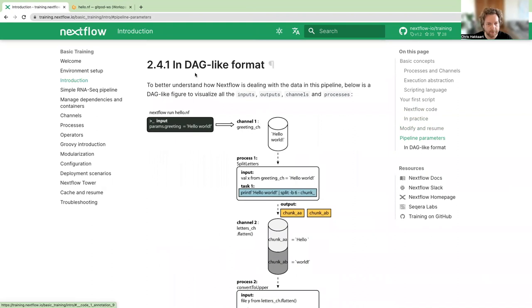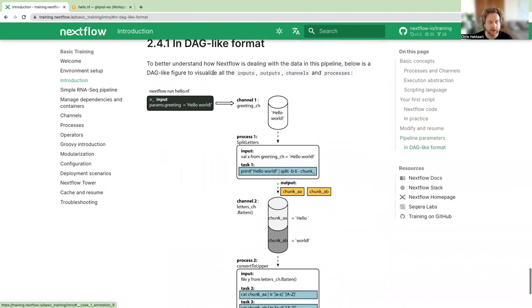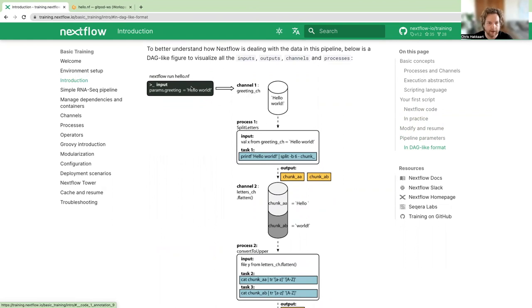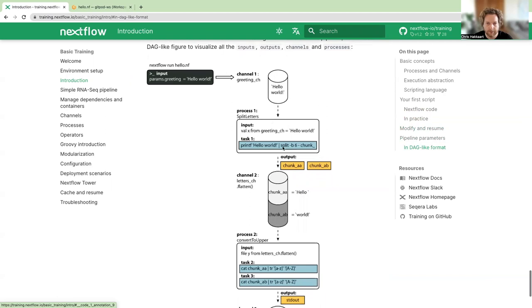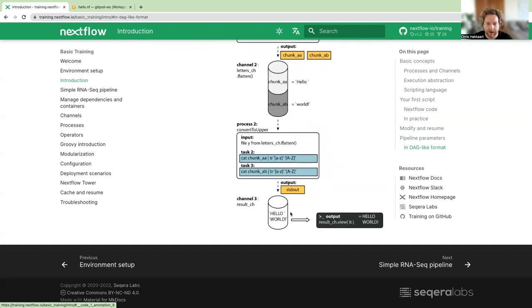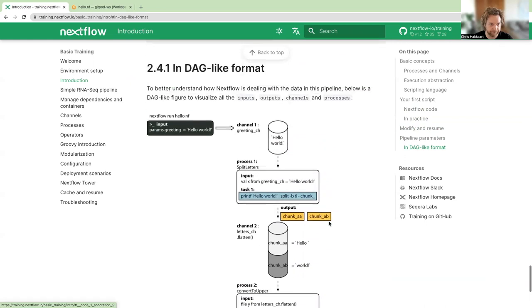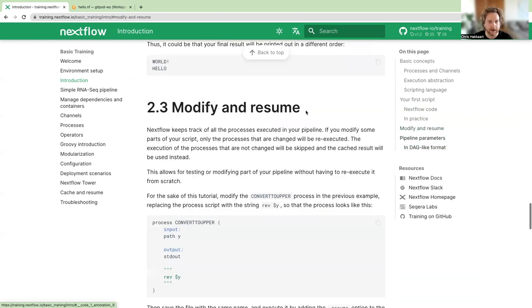Down at the bottom in section 2.4.1, some of you might be used to looking at DAGs — directed acyclic graphs. This is just another representation of what we've already done, showing that you can have your inputs put through a channel, passed through the two processes, and then outputs at the bottom.